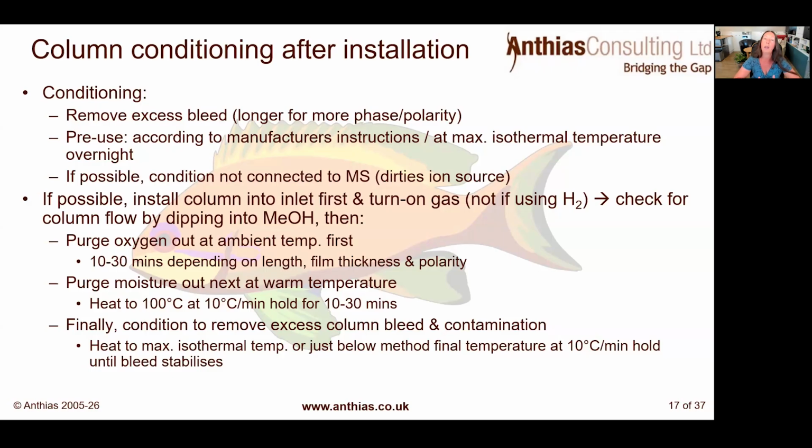Now, when we're installing our column, we're going to have air in there. Oxygen will damage stationary phases; it oxidizes them at higher temperatures. So you must always purge out the oxygen at ambient temperatures first. I always purge it out at 30 degrees C. It could be 10 minutes to purge it, it might be 30 minutes.